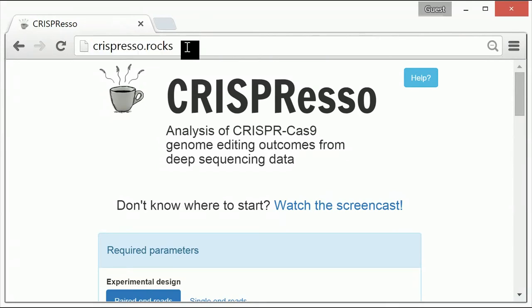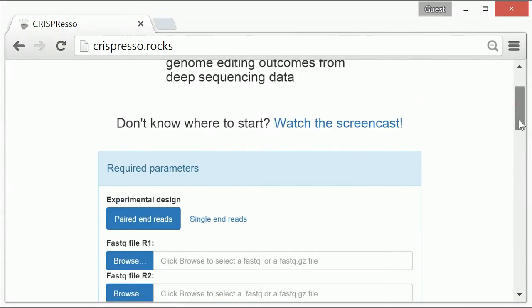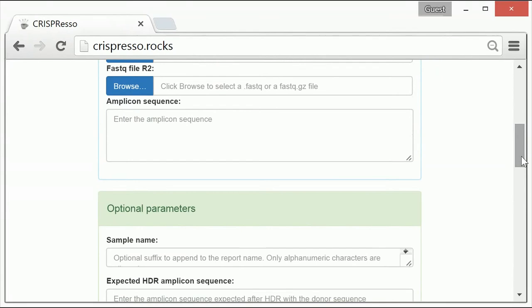This will bring you to the CRISPResso homepage. Here you will notice two headings. The first are the required parameters. And if you scroll down, you'll find the second heading, which is optional parameters.